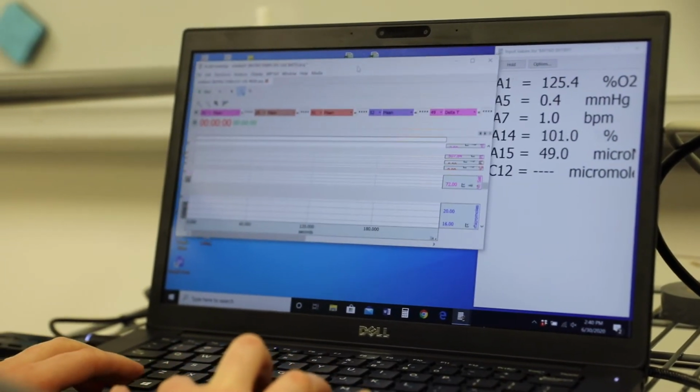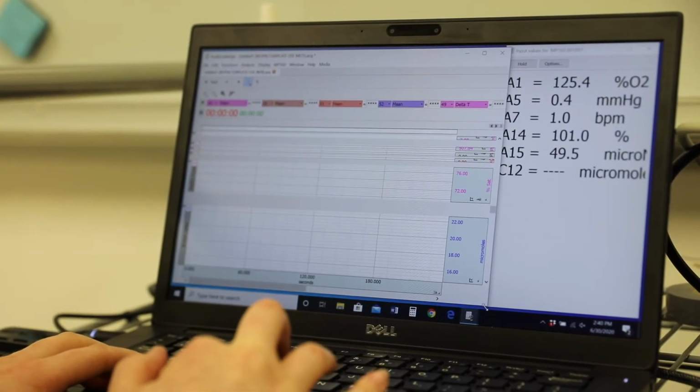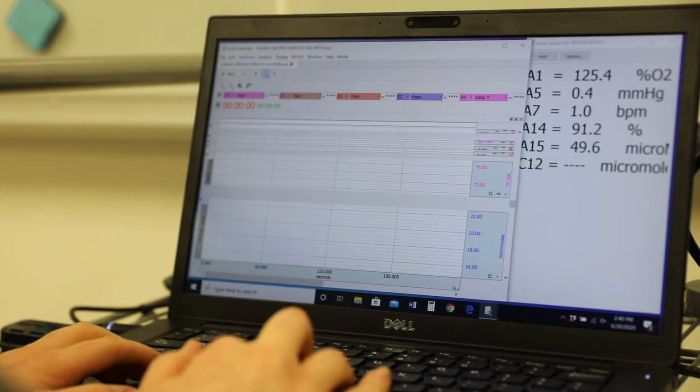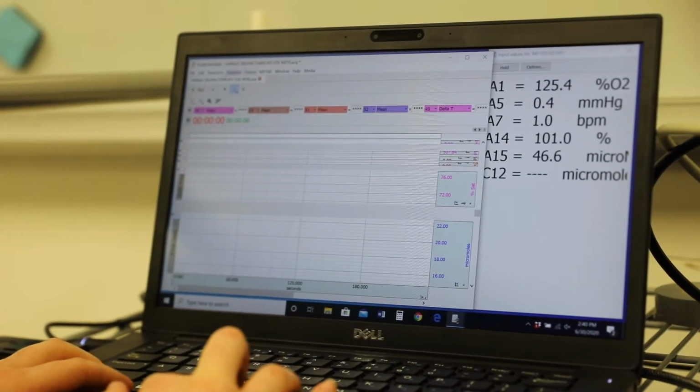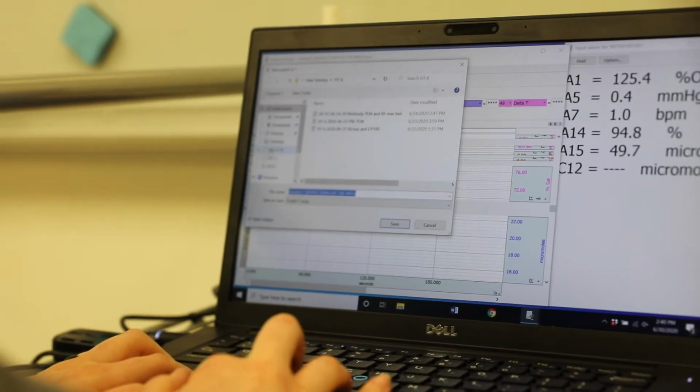So it'll open these two windows. And we're going to come over here and click on File. We're going to Save As.